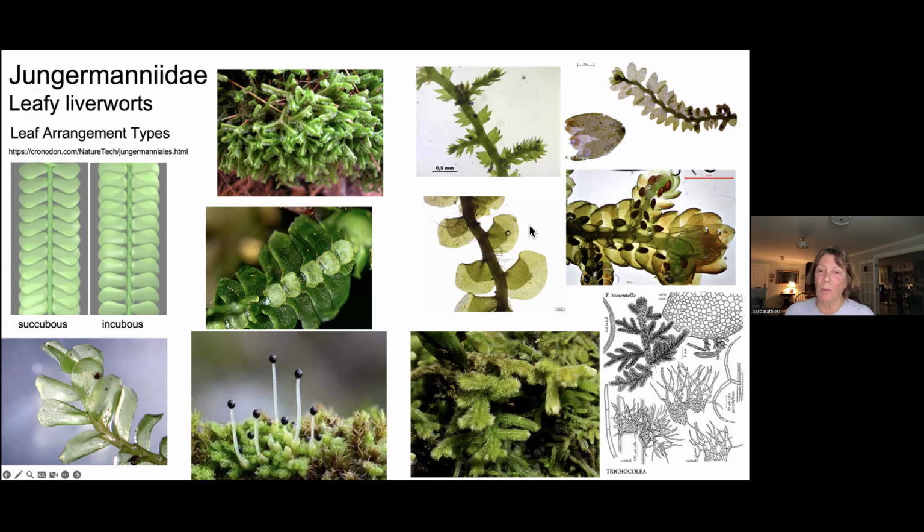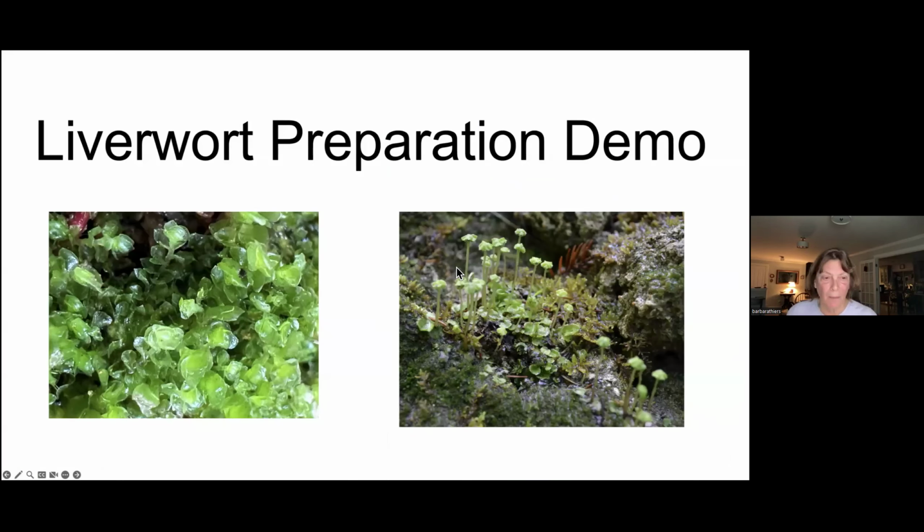They also may have lobes that are folded and pressed one lobe up against another. Here's a case in Radula where we have bilobed leaves where the smaller lobe is pressed to the larger one. And then in Frullania, which we saw earlier in Rice's presentation, the little lobe has through evolution been turned into kind of an upside-down flask. There are all sorts of fantastical variations that could be made from those flasks.